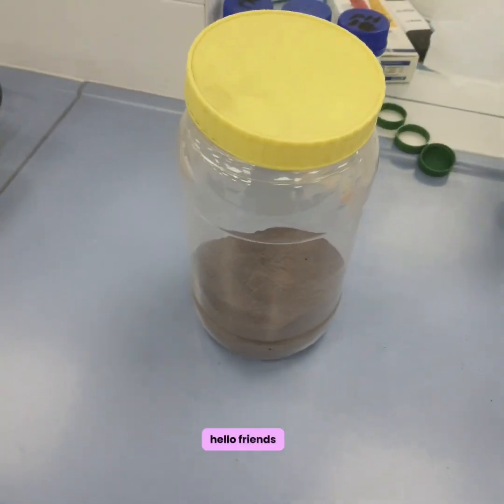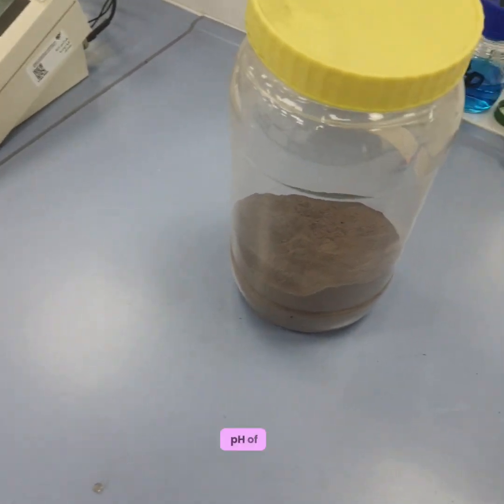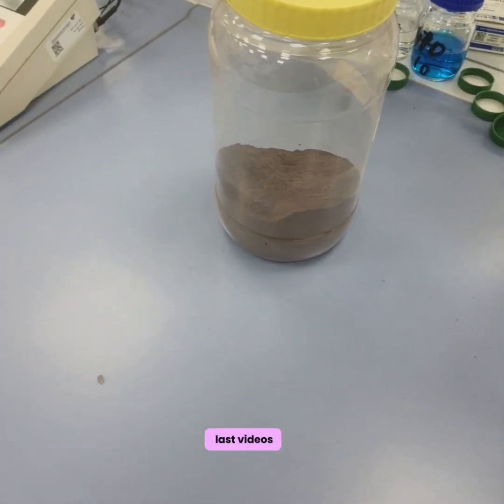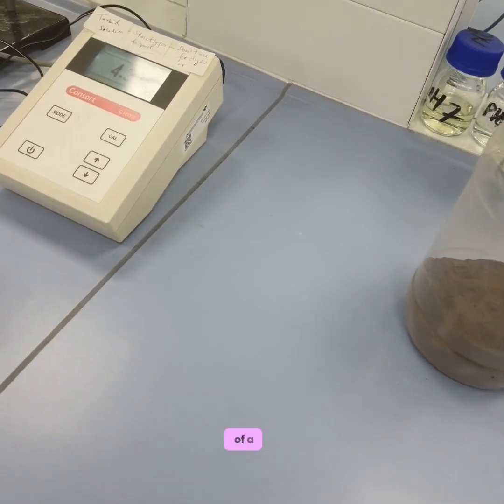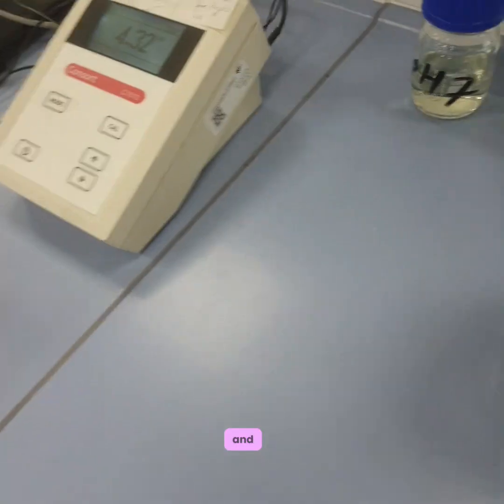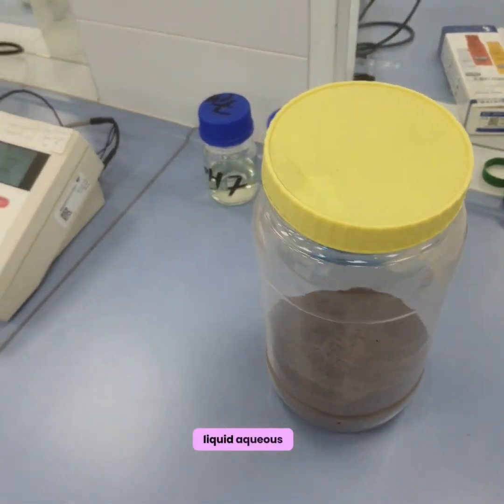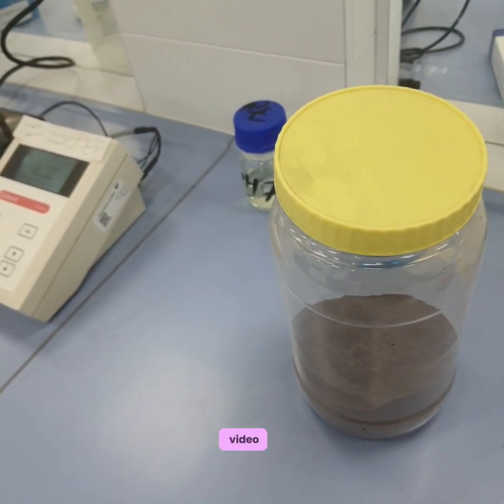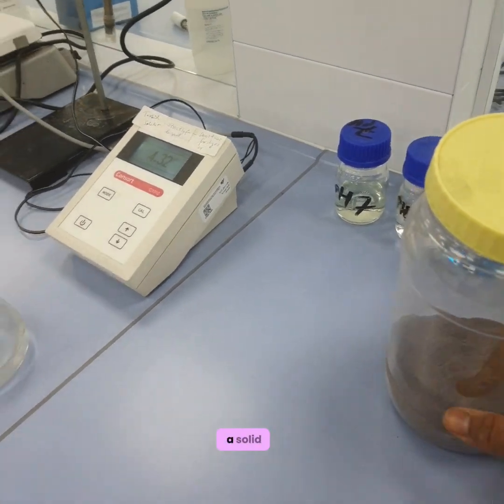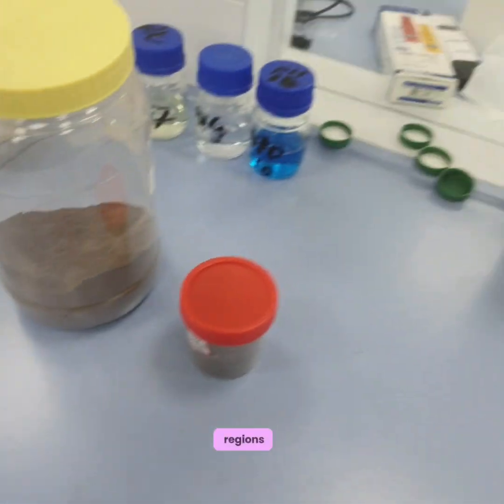Hello friends, today we are going to find out the pH of the solid sample. In our last videos, we saw the working of a pH meter, how the probe works, what buffers are, and we were computing the pH of a liquid or aqueous sample. So in today's video, this often comes to our mind: how will we find out the pH of a solid sample? In front of us we have volcanic ash from different regions.